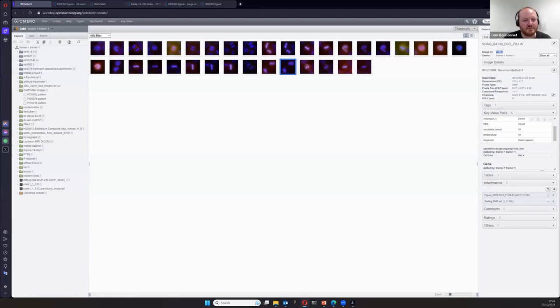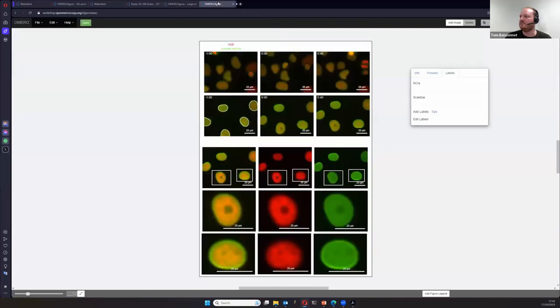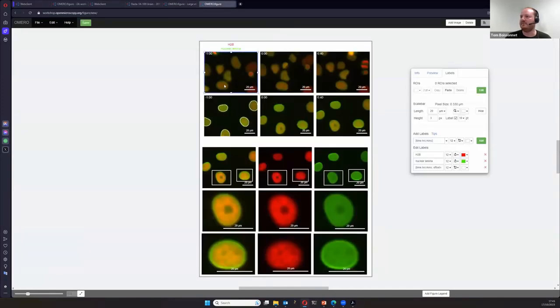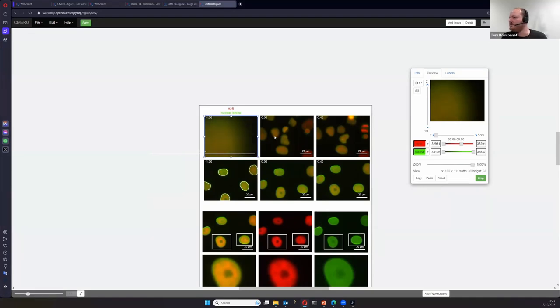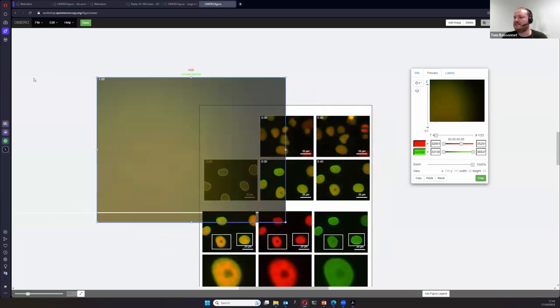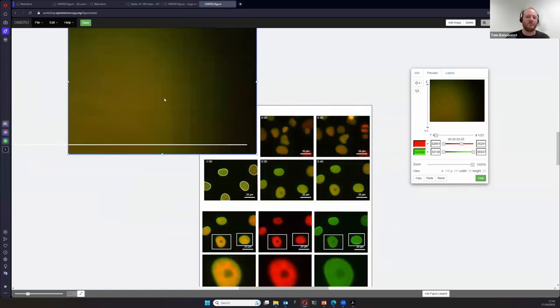There's a question: are insets and zooms interpolated, and if so, how? There is no interpolation with OMERO Figure — it shows pixels as they are. If you zoom in enough you should be able to see the individual pixels. If you show a large region you have so many pixels that it shows a sub-resolution, and while it's not interpolated, it is averaged. So you don't have interpolation in the images.